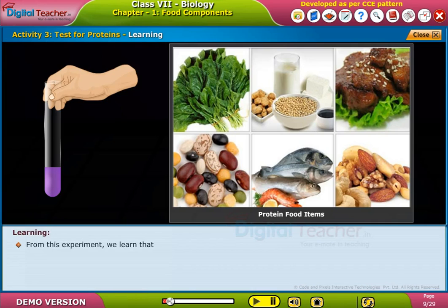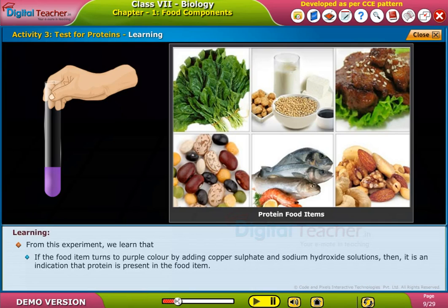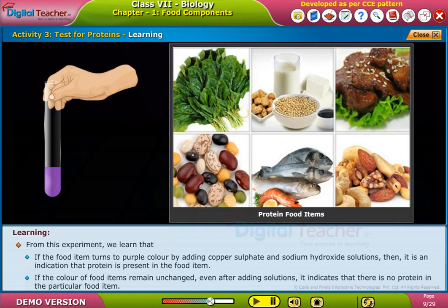From this experiment, we learnt that if the food item turns purple in colour by adding copper sulphate and sodium hydroxide solutions, then it indicates that protein is present. If the colour of the food item remains unchanged even after adding the solutions, it indicates that there is no protein in that particular food item.